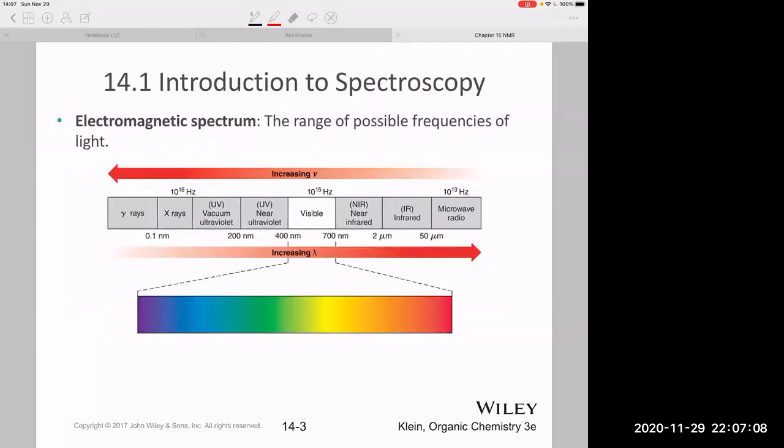So again, it is a type of spectroscopy, meaning that you are using photons and their interaction with matter in order to gain information about that matter. Just like the basic spectroscopy format that we had with IR, this is a light bulb. That was pretty terrible.